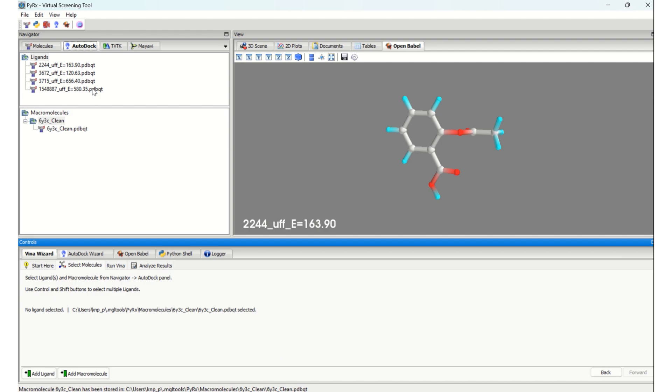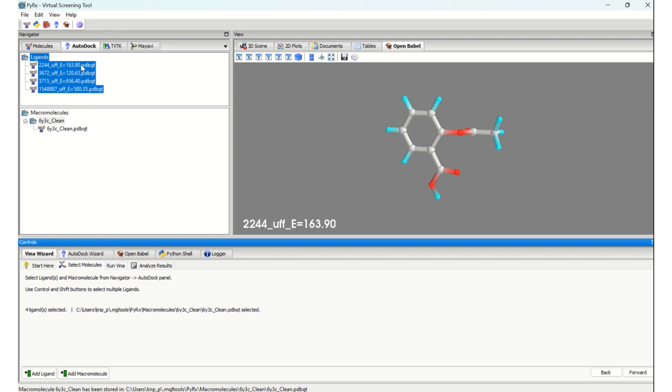Press Control on your keyboard and start selecting all the ligands. Now you can see four ligands selected, and the protein was already selected - that is 6y3c_clean.pdbqt. Once our ligands and protein are selected, we are going to go forward.